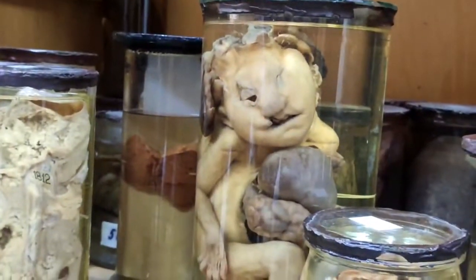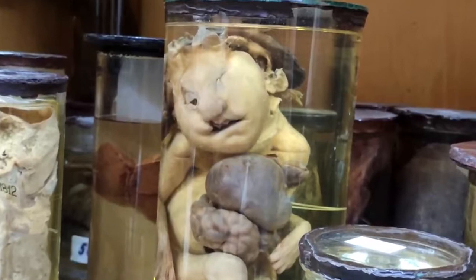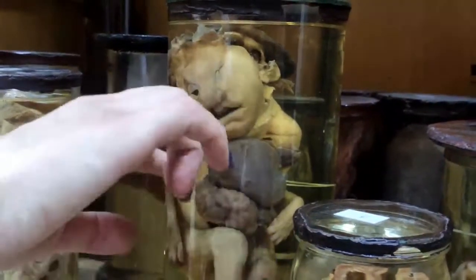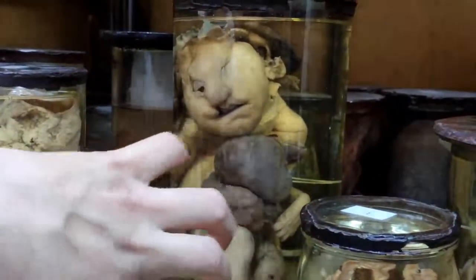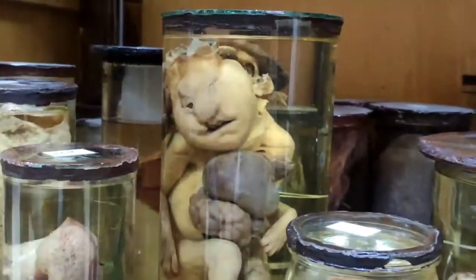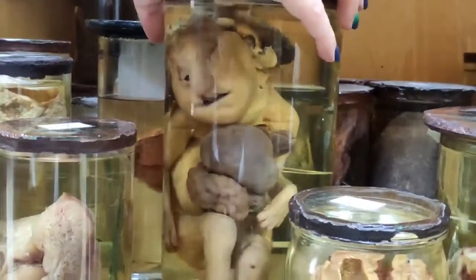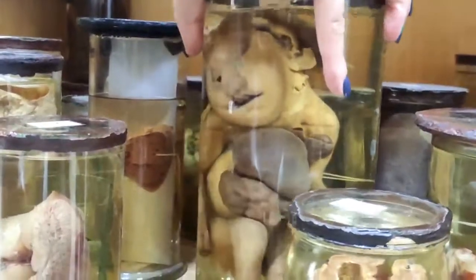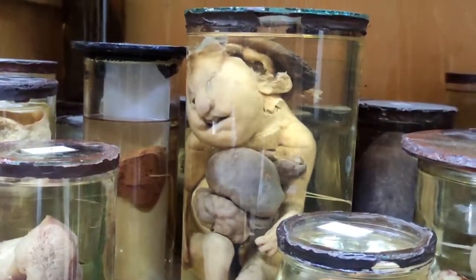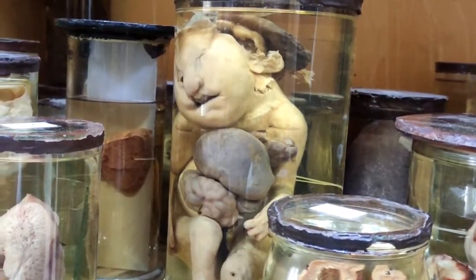The next one is multiple congenital defects in a newborn, and you can see anencephaly here, and you can see that these inner organs are on the abdominal wall. So these are multiple congenital defects, and extremities are decreased in size, also defects of the face development. So you should review these congenital defects and name something you see here.